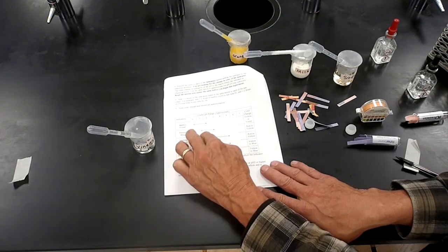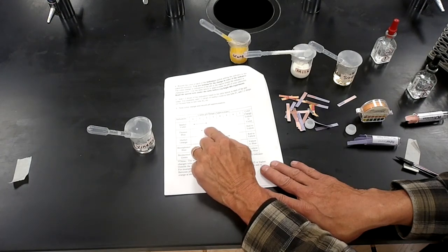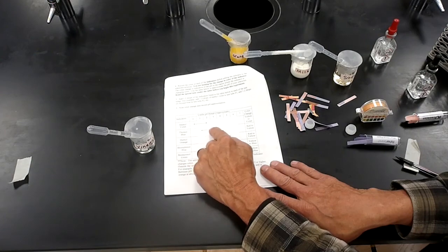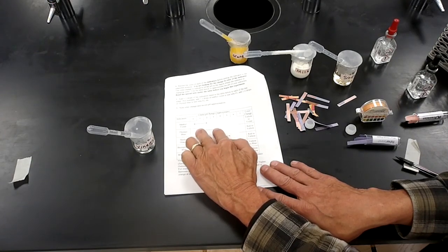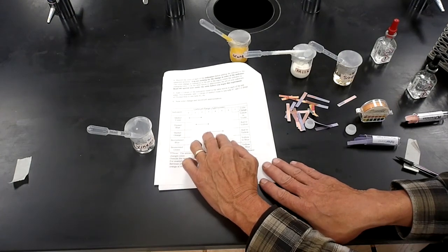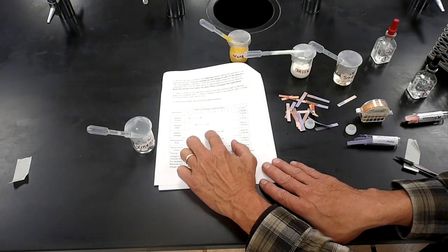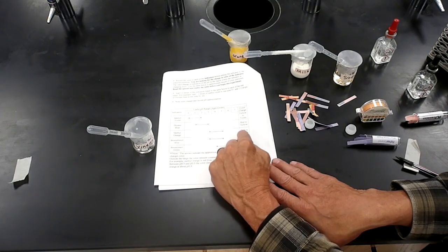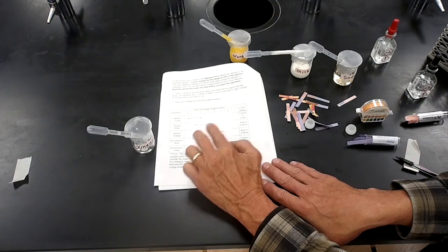and the violet. Thymol blue, notice the range is shifted a bit. Thymol blue will change from a pH of 1 to a pH of close to 4. It'll start off red at the acid end of this arrow. It'll be yellow above a pH of, say, 3 or 4. It may have a transitional color between. Same with methyl orange. It's shifted to the right more. So below a pH of 4, methyl orange will be red. Above a pH of about 5, it's going to be yellow. Between the ends of that arrow, it might have a transitional color.